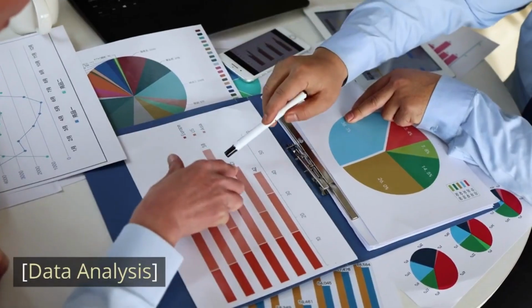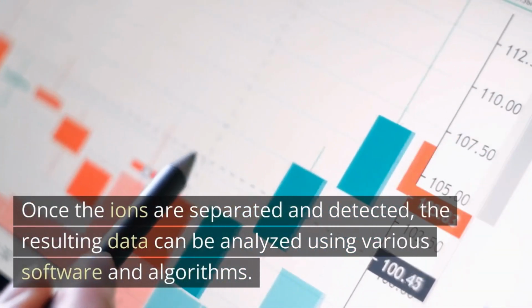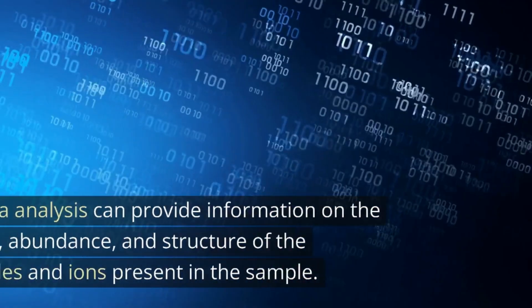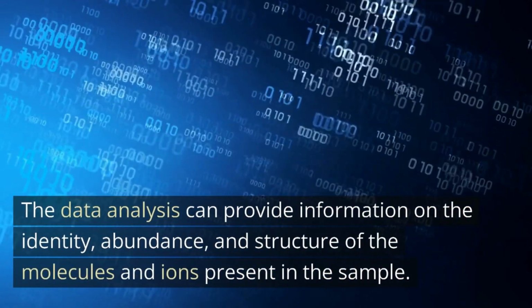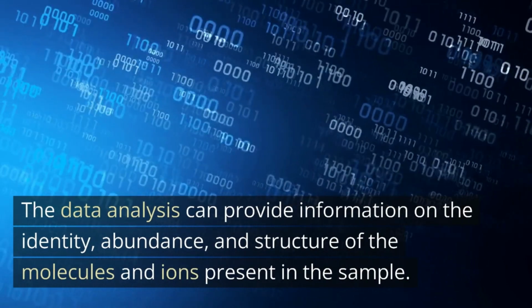Data analysis. Once the ions are separated and detected, the resulting data can be analyzed using various software and algorithms. The data analysis can provide information on the identity, abundance, and structure of the molecules and ions present in the sample.